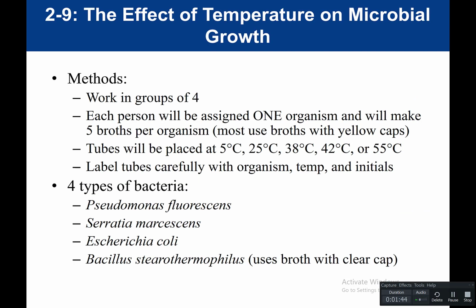So let me show you that. The temperatures that we would be using for this experiment would be 5 degrees Celsius, so this would be our refrigerator. 25 degrees Celsius, this would be our room temperature. 38 degrees Celsius, which is similar to human body temperature. 42 degrees Celsius and 55 degrees Celsius.